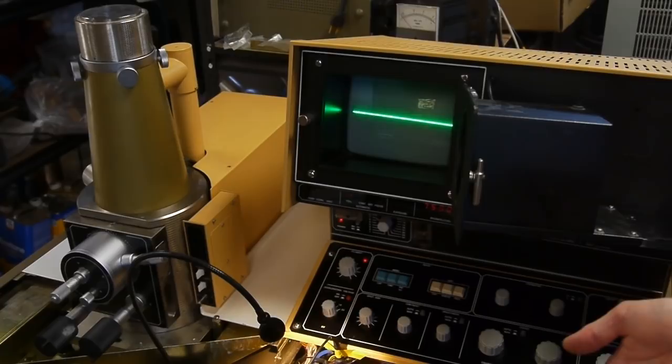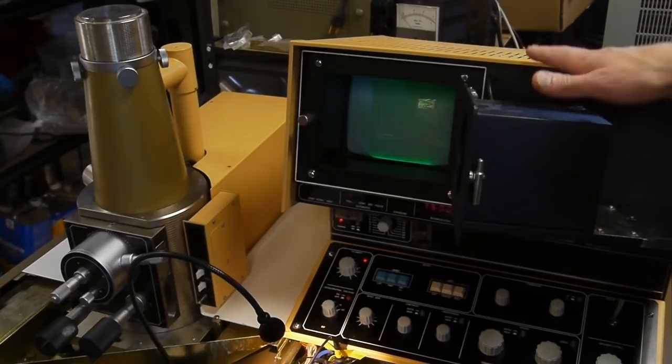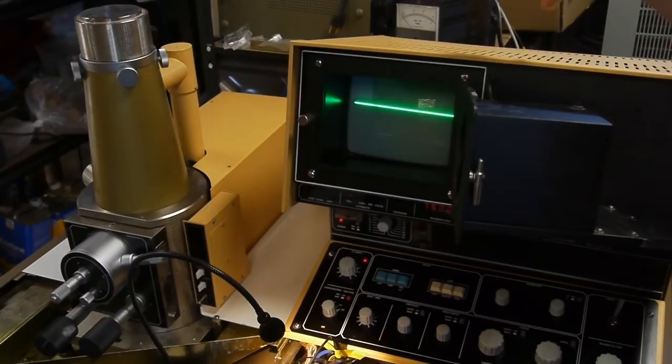However, if we had a camera with its shutter open or if we had a digital acquisition system, we could collect that high resolution image. And remember, the only reason that we're doing this slowly is just to collect basically more electrons from the sample.